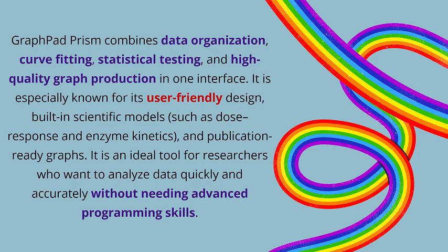GraphPad Prism combines data organization, curve fitting, statistical testing, and high-quality graph production all in one interface. It is especially known for its user-friendly design, built-in scientific models, and publication-ready graphs. It is an ideal tool for researchers who want to analyze data quickly and accurately without needing advanced programming skills.